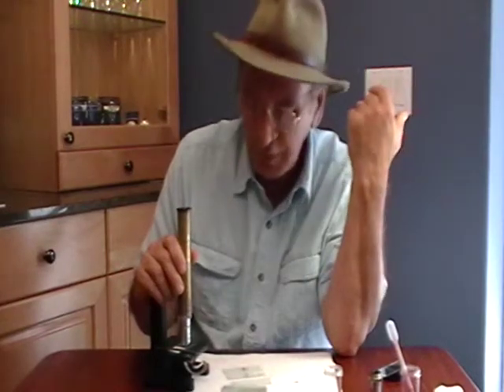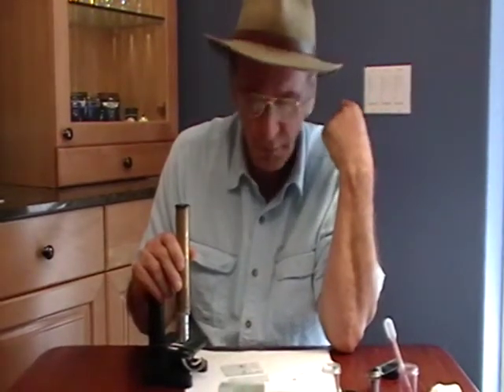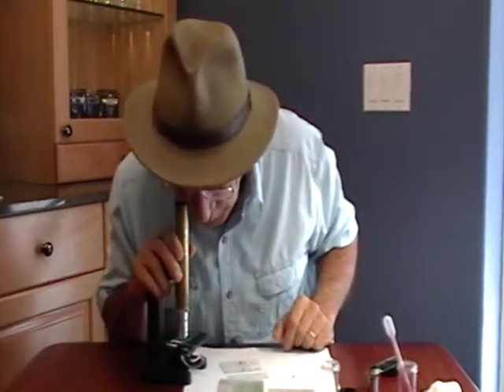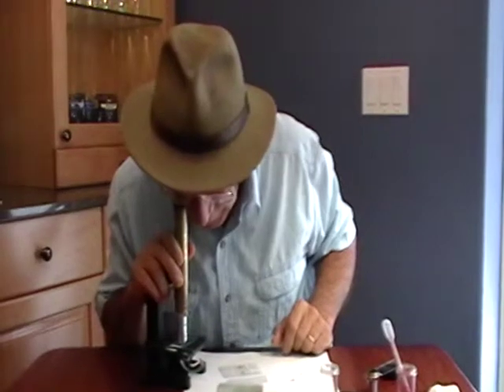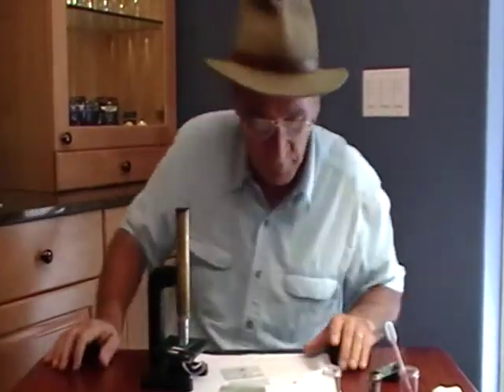If you're going to use the 40x, I don't recommend it for amateurs — you really have to know what you're doing. I recommend you start with the 5x eyepiece. The 200x works quite well. It's relatively easy to focus compared to other scopes of this power, and it's a good way to start out.